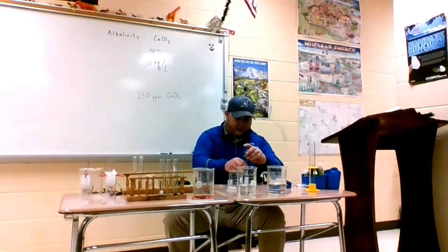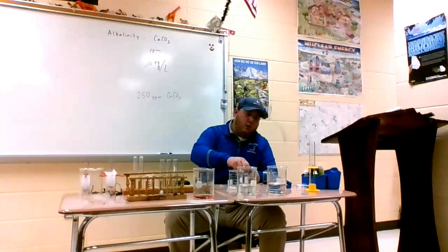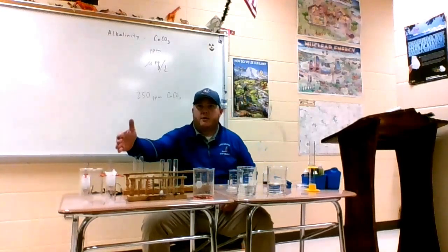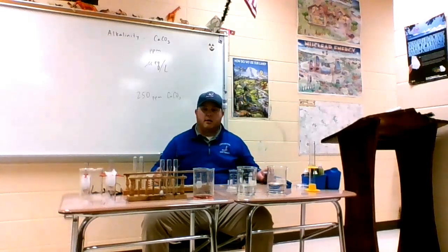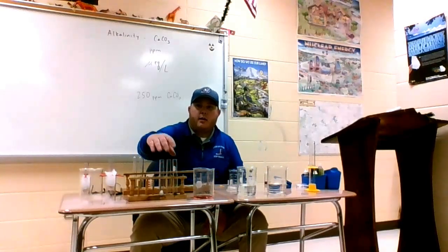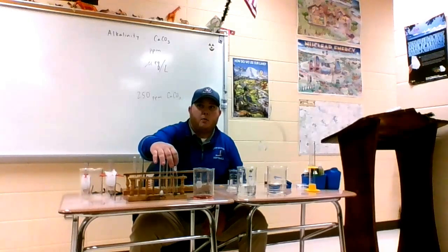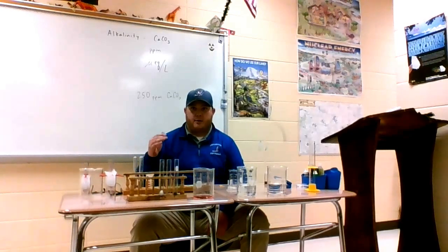So there is the alkalinity. When I do this demonstration, we're going to look and see how different substances, like different soil and different rocks, will buffer the acid rain out.